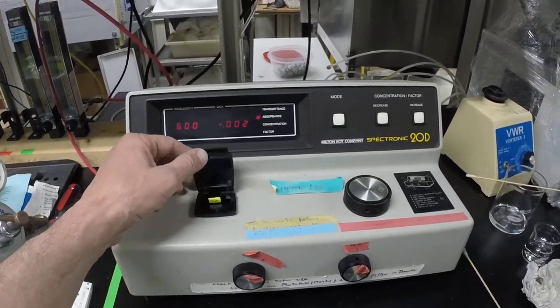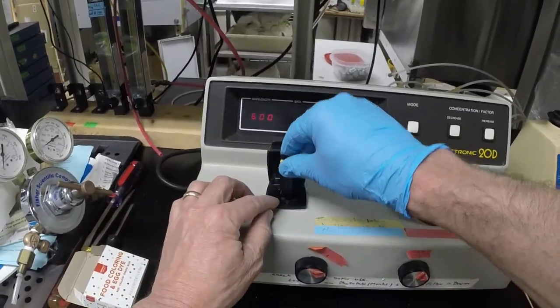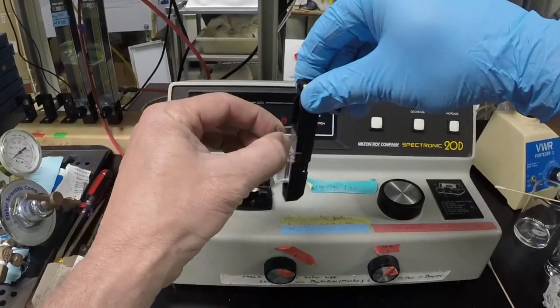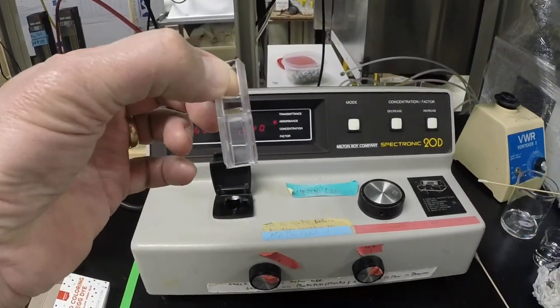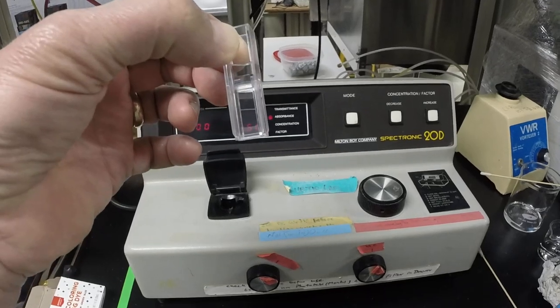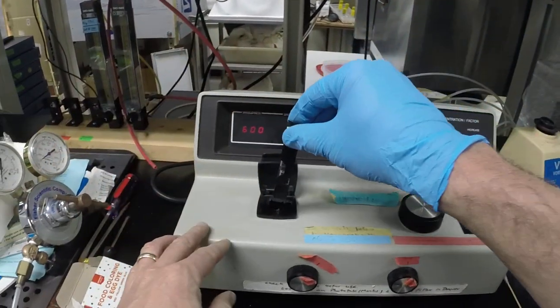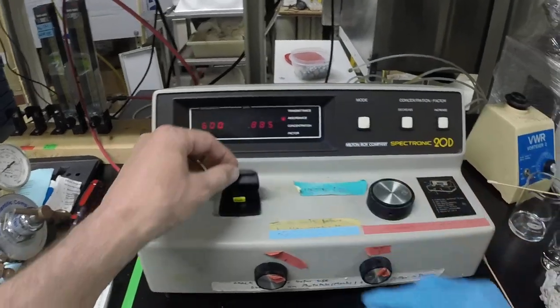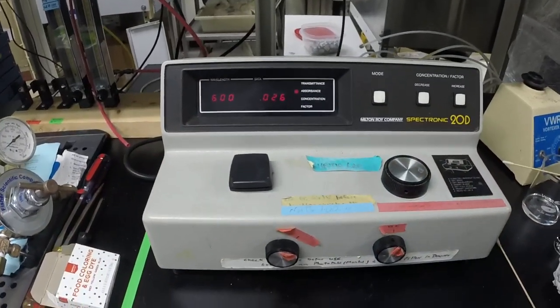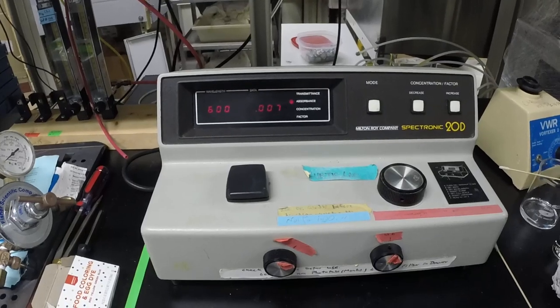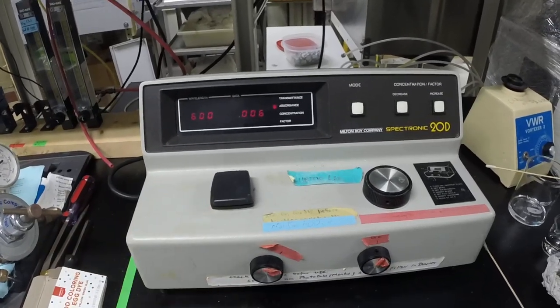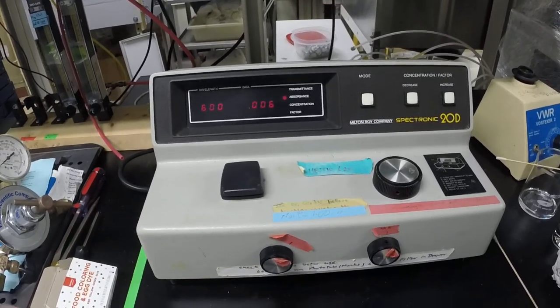If I now put a sample into the cuvette here, that has either cells or a dye or whatever in it, then when I place that inside there, it'll now read that absorbance on a scale spanned from zero to one, and that one centimeter path length. So that's how it functions.